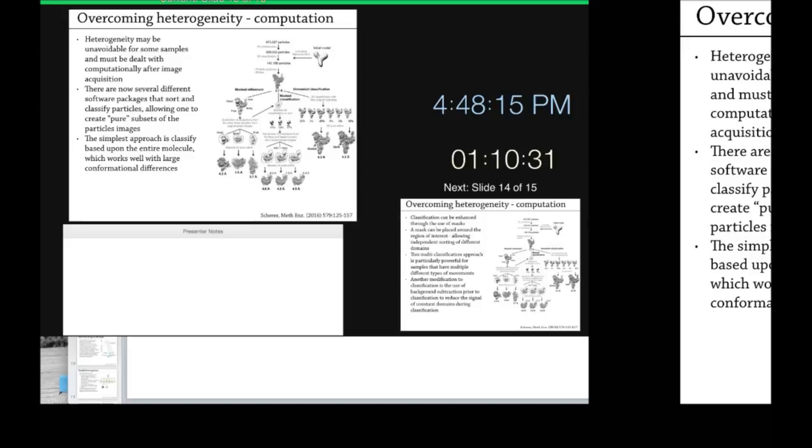But there are two different ways to do it, and that's why it can be helpful to try multiple reconstruction algorithms. With RELION, you filter down to the smallest subset possible, which you think is the purest, cleanest, most homogeneous. With FREALIGN, you don't necessarily do that because you can weight particles. It's all done automatically, so there's less bias, which in the end, if you end up with a similar reconstruction, sometimes you can get better from FREALIGN, sometimes you can get better from RELION, sometimes you get better from a subset, sometimes you get better from all. It depends on how heterogeneous your data really is and how well you're able to sort out good from bad. If you're throwing away good with bad, then that'll negatively affect your reconstruction most of the time in the end.